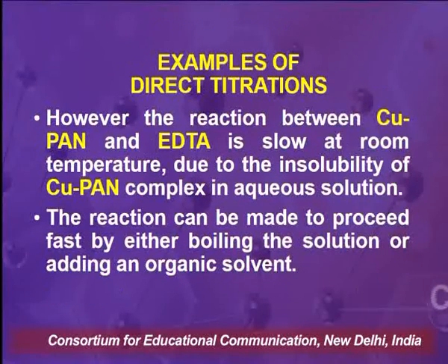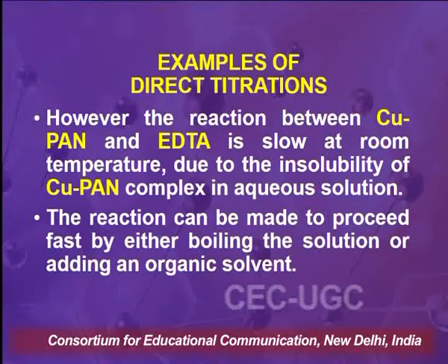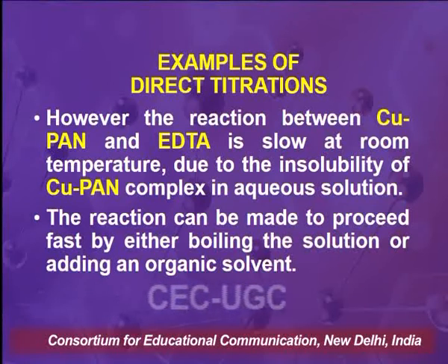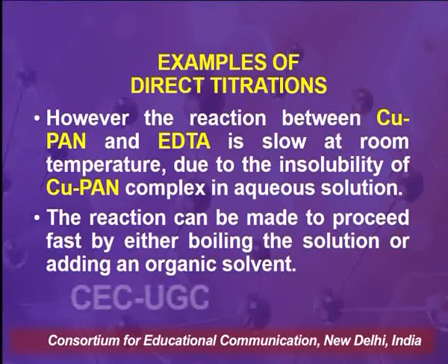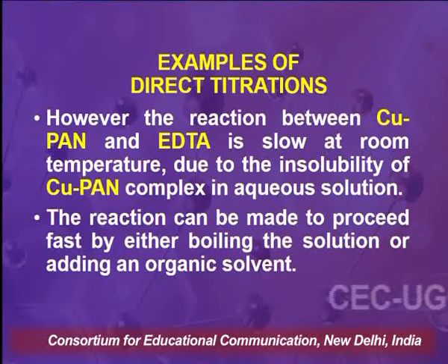However, the reaction between copper PAN, that is the copper indicator complex wherein the indicator is PAN, and EDTA is slow at room temperature due to the insolubility of the copper PAN complex in aqueous solution. This reaction can be made to proceed fast by either boiling the solution or by the addition of an organic solvent.